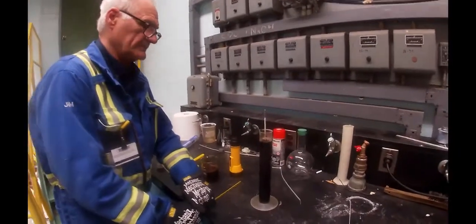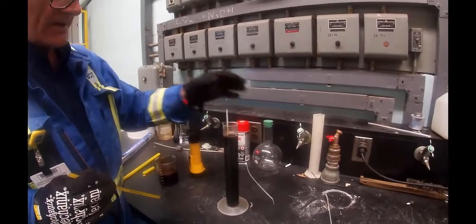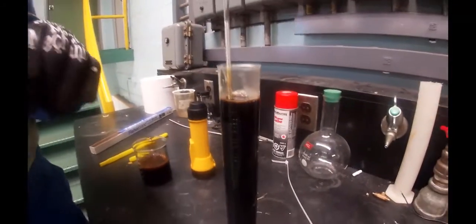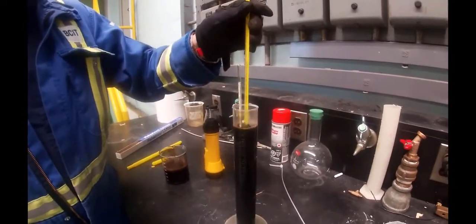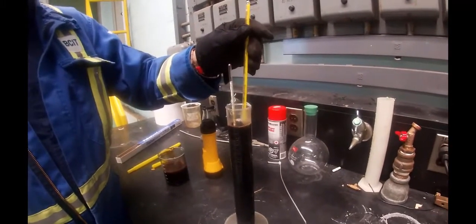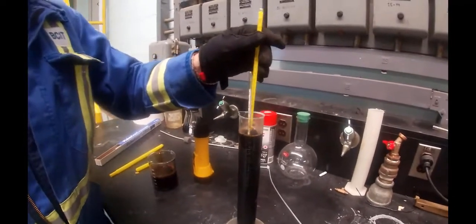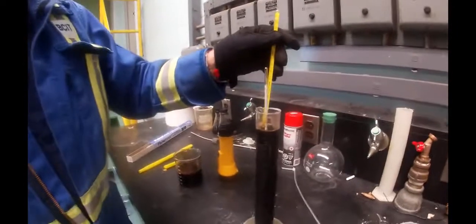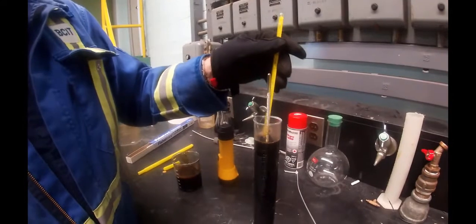Okay, starting in. So, hydrometer is in there and it's reading around, gee, that's low. It's about 6.5, but it's at elevated temperature, so we'll have to do a fair amount of temperature correction. This temperature is in Fahrenheit. It's up at 110 now, climbing pretty fast.